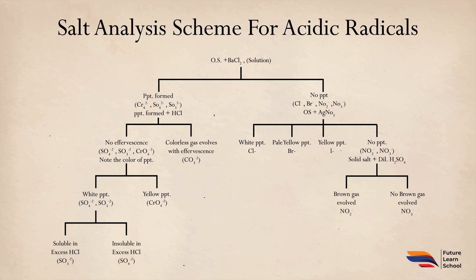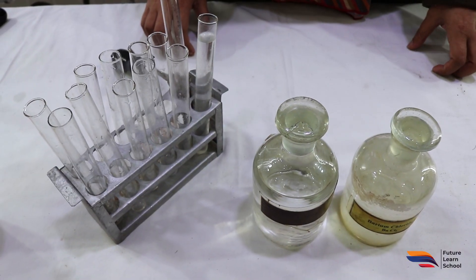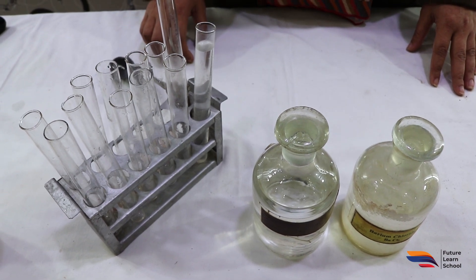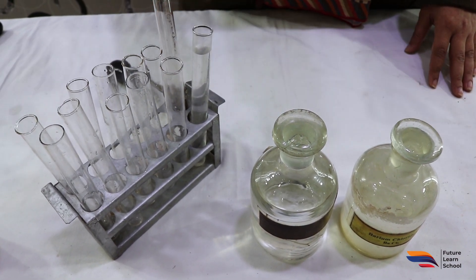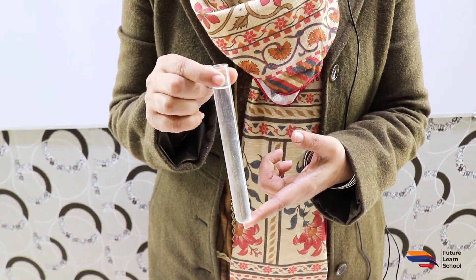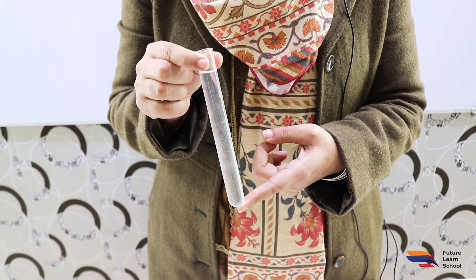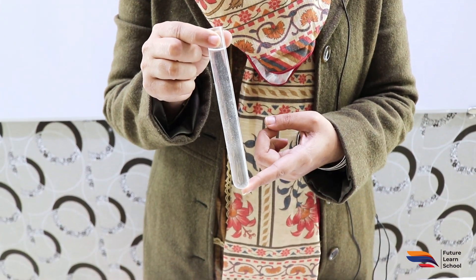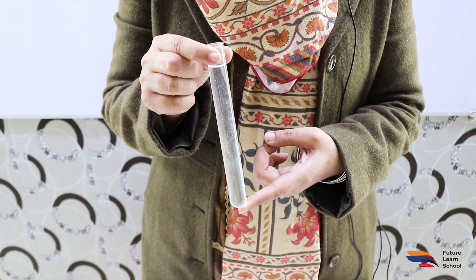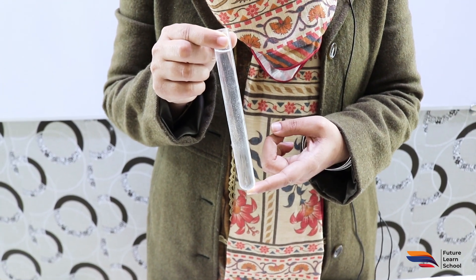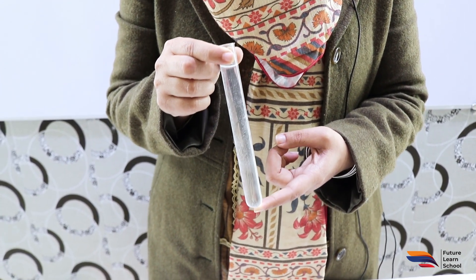Now we move to the practical portion. When you receive a salt for acidic radical analysis, you must first make a solution. Here we have an unknown salt; we add water to it and prepare the original solution. We then identify whether the acidic radicals belong to Group 1 or Group 2.